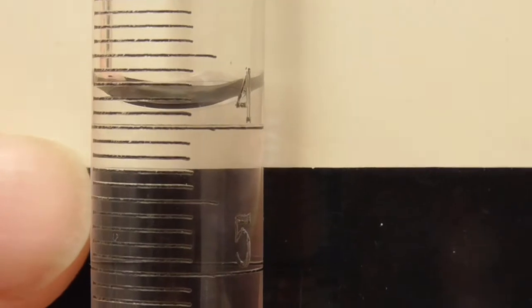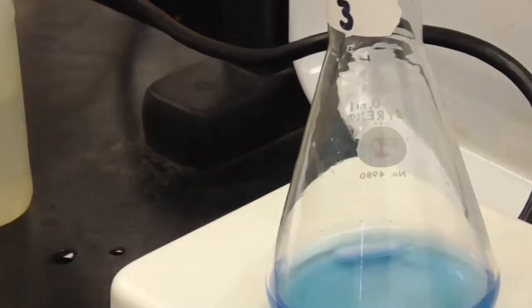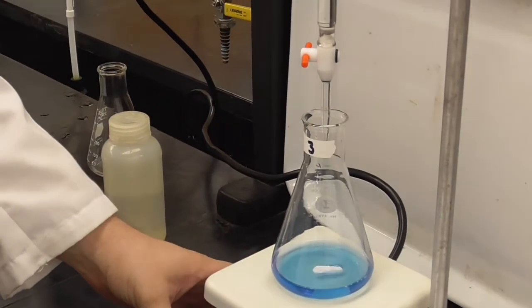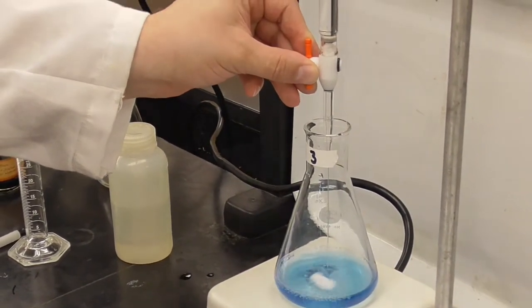Okay, we are ready for trial number 3. And here is the burette reading at the start for trial number 3. So I'm going to come back out here and see if I can find the solution. There we are. Trial number 3 is going under the burette. And so Dr. Dene is going to start that titration. Again, I'm going to pause it so that you don't have to watch the entire piece.